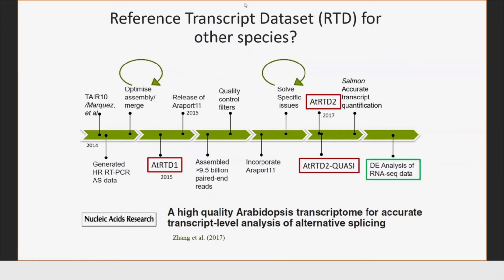So if no more questions, sorry, go ahead. I have a question about this splicing variance. Primarily, if it comes from the same genome region, do you count it as the same, or do you distinguish isoforms in the result? We can distinguish isoforms in the result. So for example, if some isoform is missing in one condition, you can detect it.